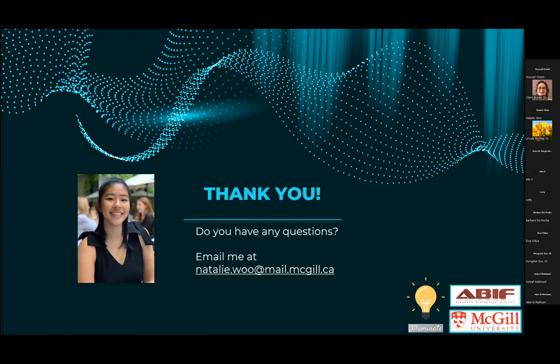So they just add PBS, which has salt. And then that salt is what ends up drying it, and then they use it for storage. And this is what Ed Boyden's group has mentioned in one of their Q&A sessions. I haven't tried it, but I thought it's interesting because if you can just add some salt and it'll dry up, maybe you can store it for later imaging.